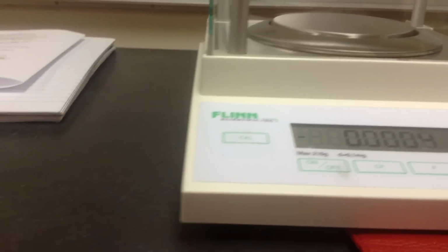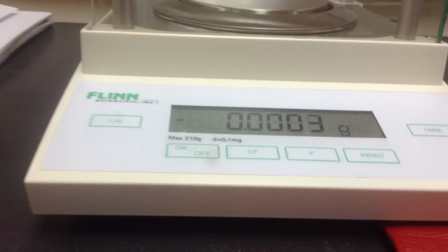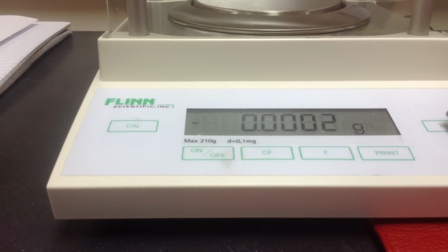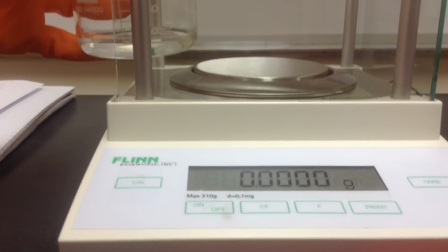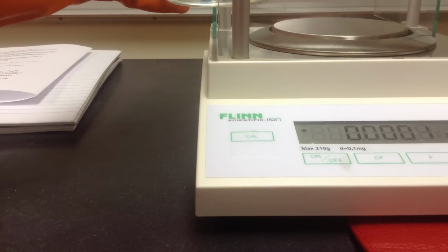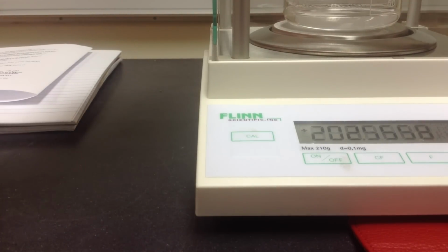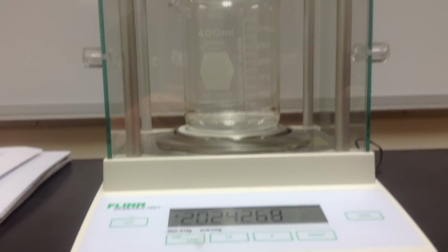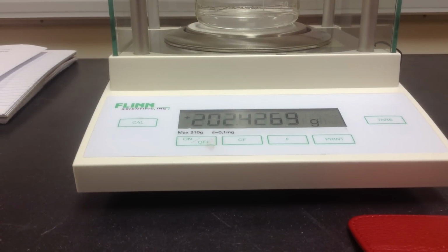So let's go back to our scale. And again, we want to make sure that it's at 0 to begin with. So we'll press the tare button. Very carefully place the system inside. Close both windows so that there's no air that pushes through and changes the reading.